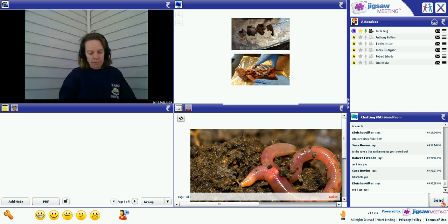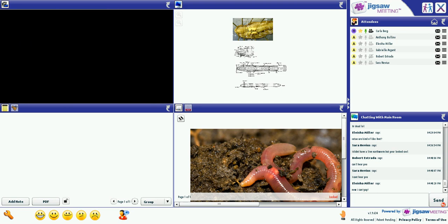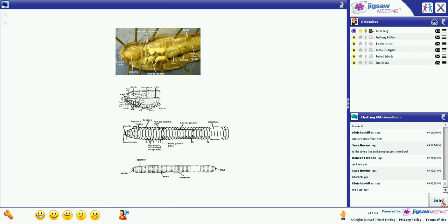Okay, Alicia, once you're done, go ahead and click yes. All right, perfect. So everyone's is open. Now, in a perfect world, your earthworm is going to look very similar. I'm going to turn my camera off to the diagrams up on the whiteboard screen. However, for our first dissection, I am positive that everyone's does not look as perfect as these.